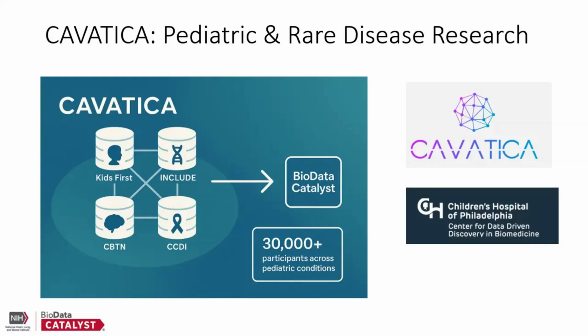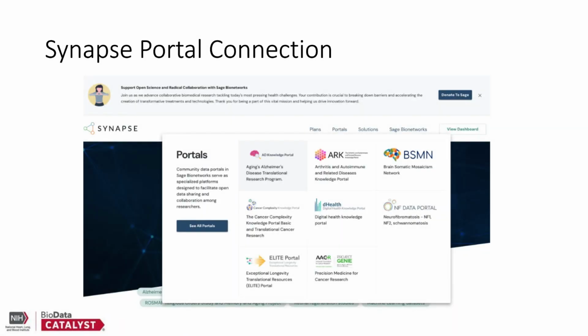The connection uses the same standardized DRS protocol as our other integrations, ensuring secure and consistent access across platforms while maintaining appropriate data access controls. The second connection is to Synapse Portal, which serves as a collaborative research network across multiple disciplines.